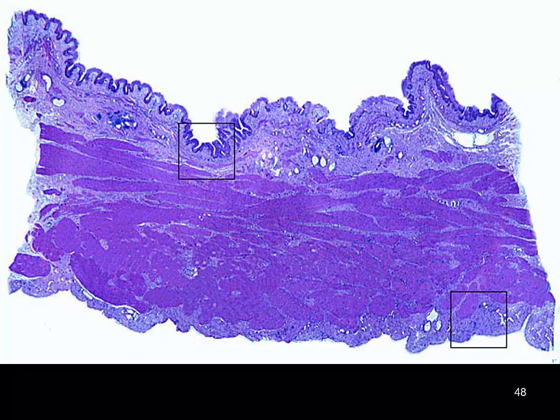Another location for smooth muscle is going to be our urinary tract. Here we're looking at urinary bladder. We have our epithelium lining this. And do you remember the epithelium of our bladder? What is that classification going to be? Transitional epithelium. We can't see it here, so I was just asking you for your location. And then as we get down into these deeper regions, we're going to see different layers of our smooth muscle.